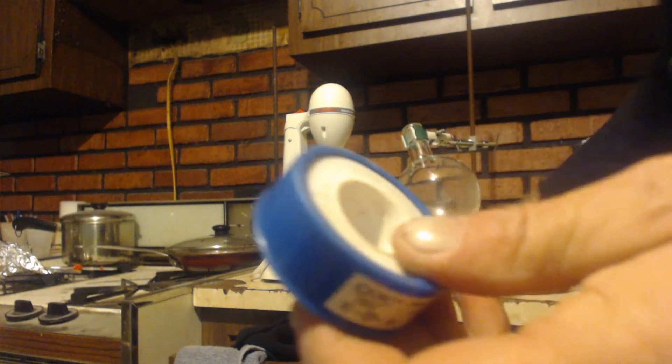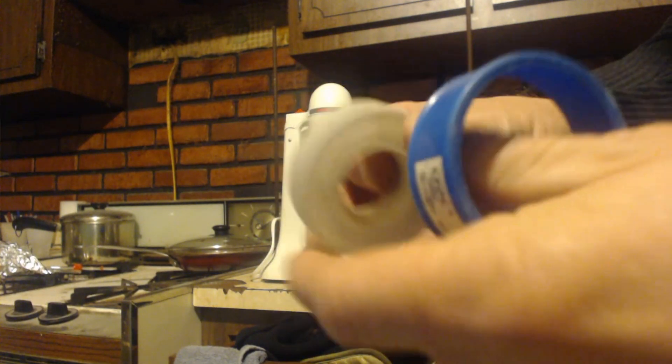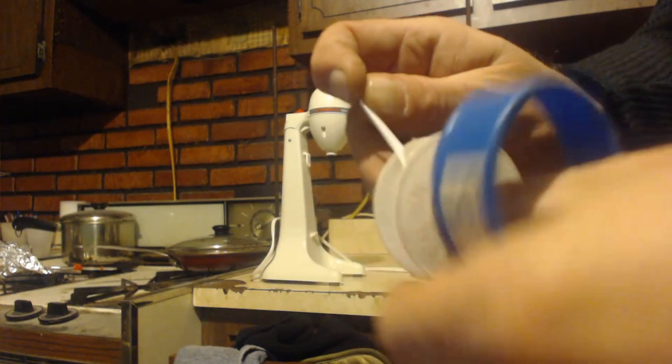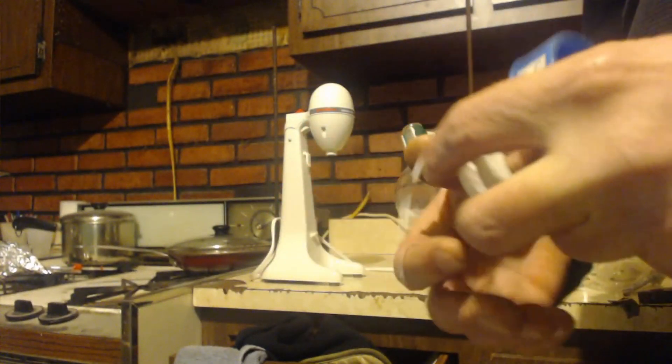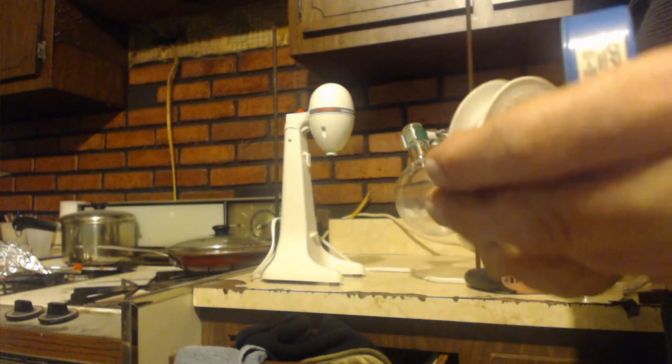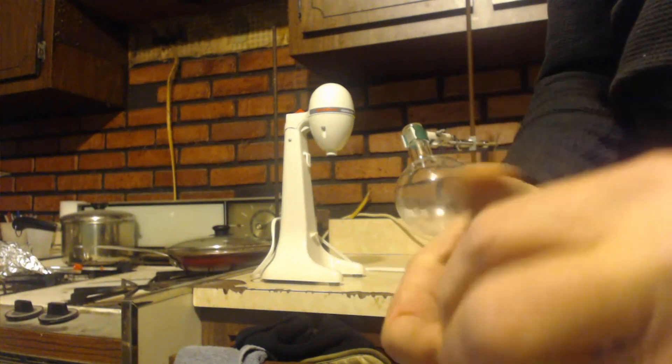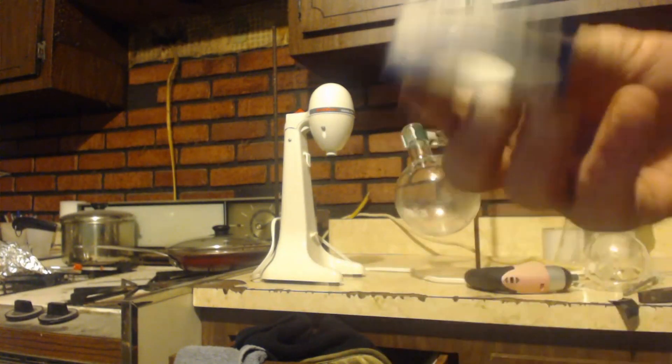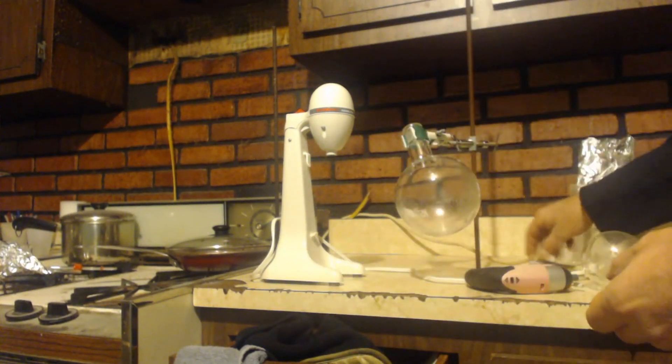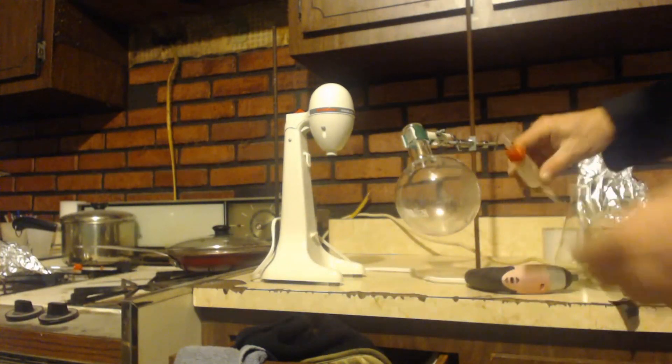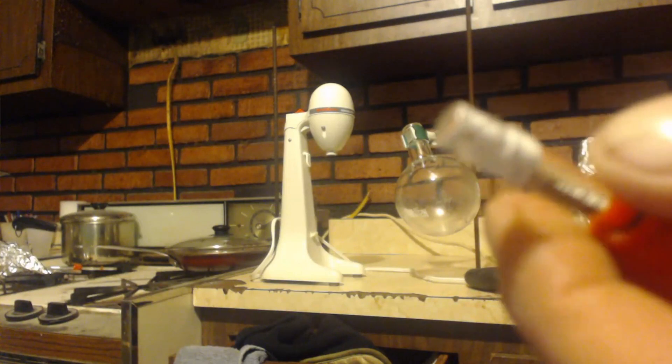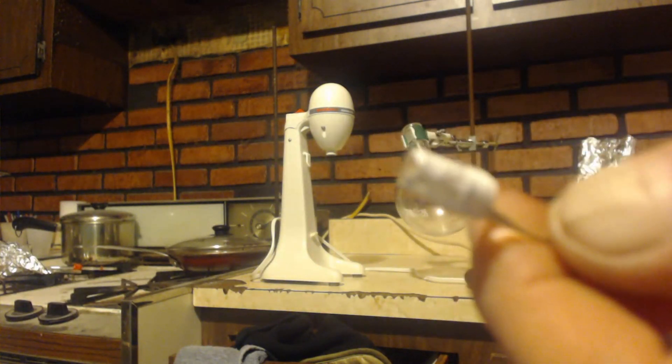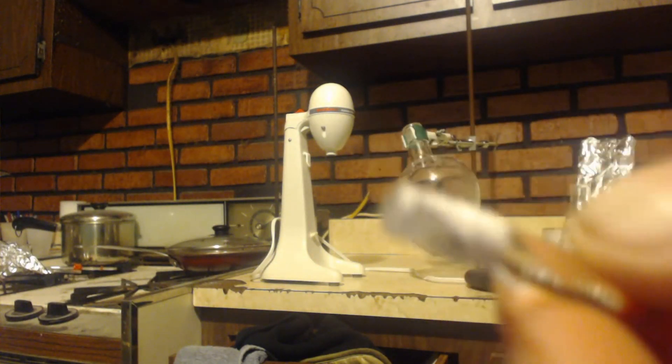I got some of this teflon tape, which is just plumber's tape. It's that tape that you put on your threads of plumbing stuff so that it doesn't leak out water. I got some of that and I put it on the end of this.